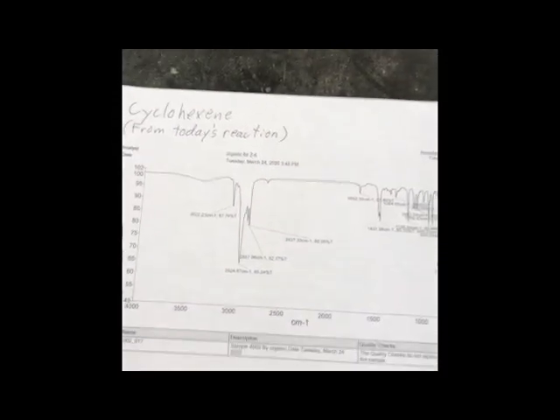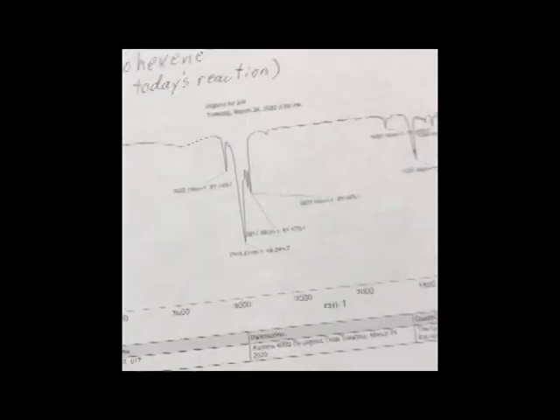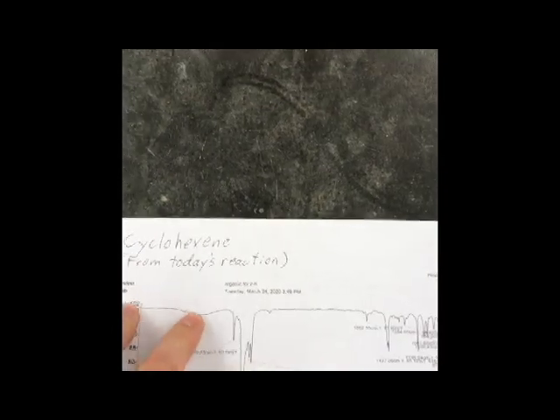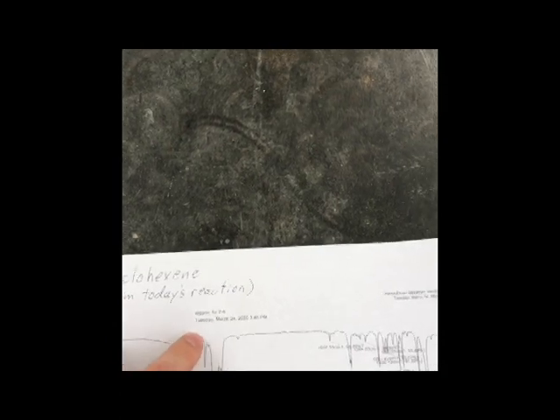So then if we go over to the IR of our final product, you can see some similarities here. I won't go through all of these, as it's part of your assignment to go through and characterize with your spectra. One thing I will note is there is a little lump right here. That would be something to touch on in your lab reports. This isn't a peak, it wasn't picked out, and there's not a value, but I would talk about what this might be.